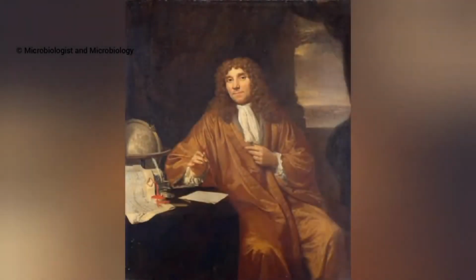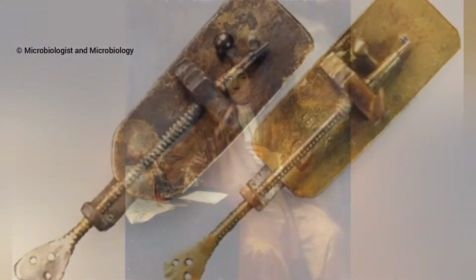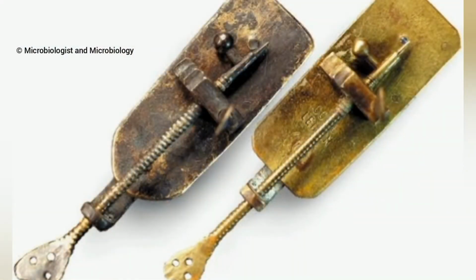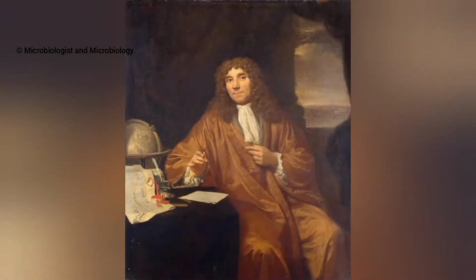Later, Anton van Leeuwenhoek began polishing and grinding lenses when he discovered that certain shaped lenses increased an image's size. The glass lenses that he created could enlarge an object many times. The quality of his lenses allowed him, for the first time in history, to see many microscopic animals, bacteria, and intricate detail of common objects. Leeuwenhoek is considered the founder of the study of microscopy and played a vital role in the development of cell theory.